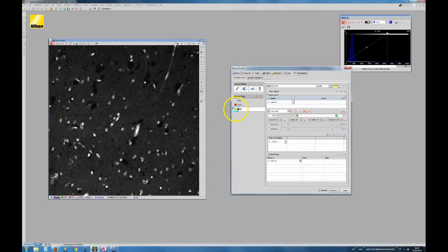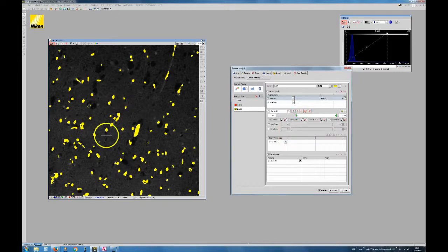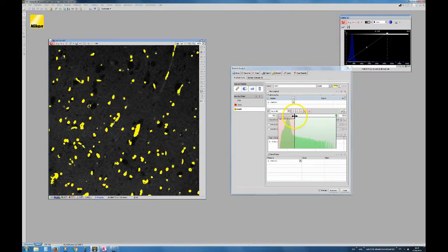If I show my mask now, you see that the edges are a lot smoother and I don't have all these small dots everywhere. So it's much easier now to segment the nuclei. I still have some bits that go a little bit wrong, like tiny things, but this is a tissue, so tissues are difficult in general to segment. I also have some objects that have a hole like this, but I can fix this afterwards.